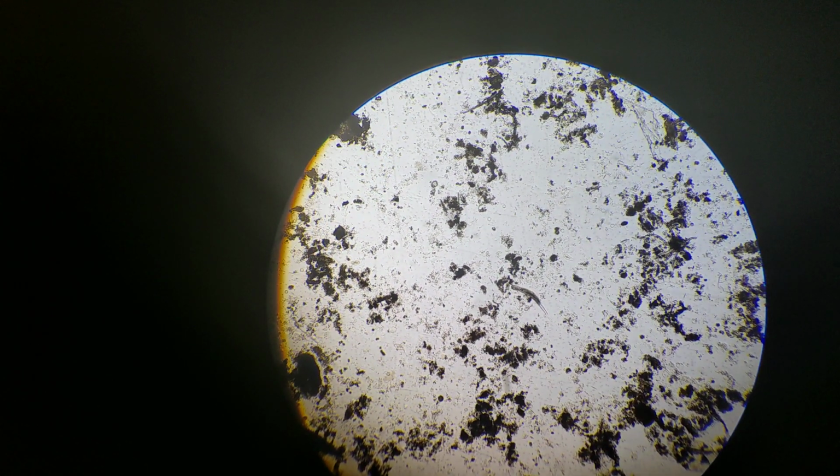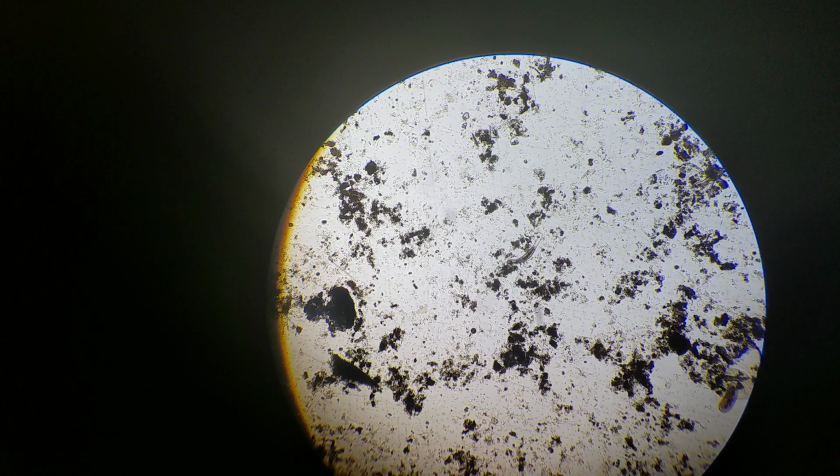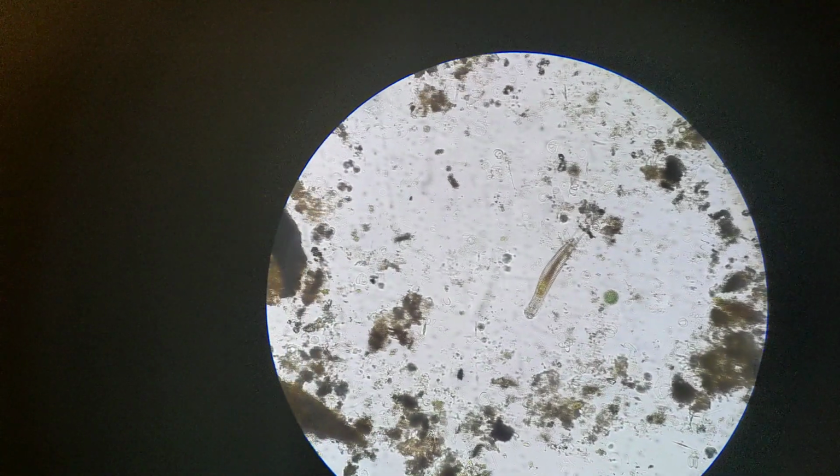Today is Thursday, August 24th, and I'm looking at a sample of pond water I got from Morningside Park earlier this week. And I have just found this thing here. Hold on, let me adjust the phone. It's not quite lined up with the eyepiece correctly. There we go, that's a little better.